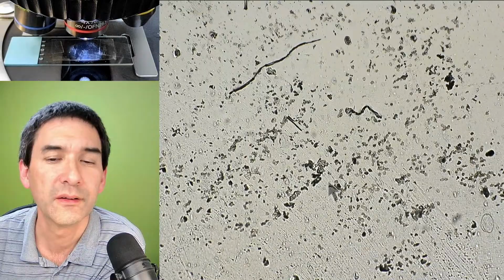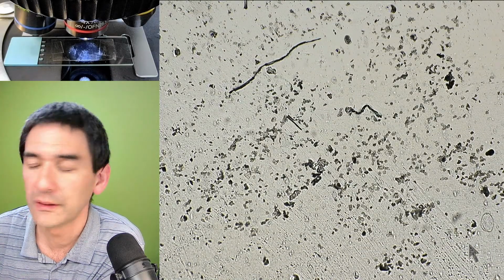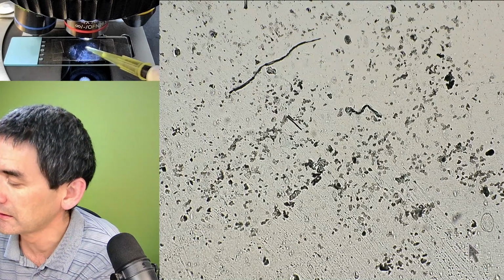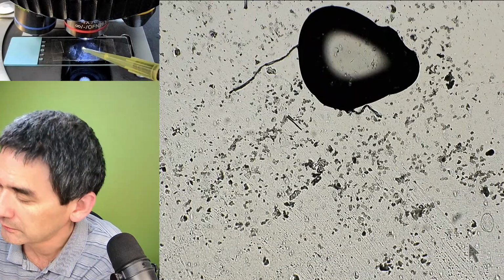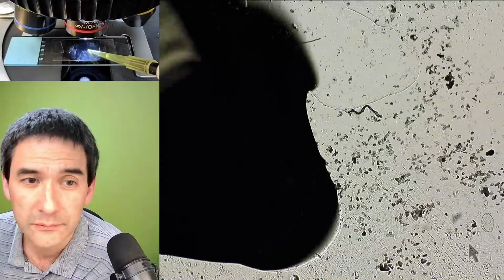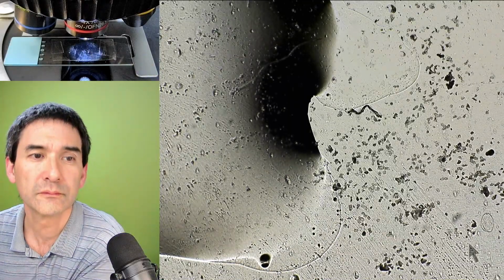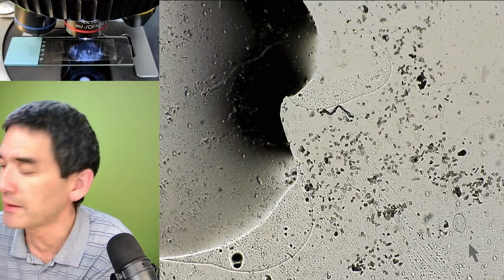Let's remove the arrow here. And let's add a little bit of oil. You can immediately see that where the oil touched it, it becomes more transparent.